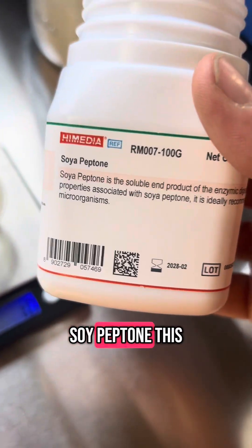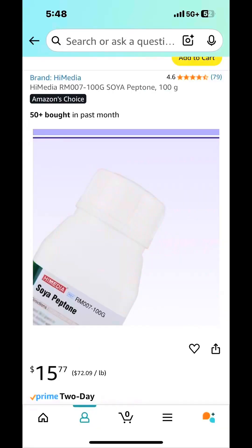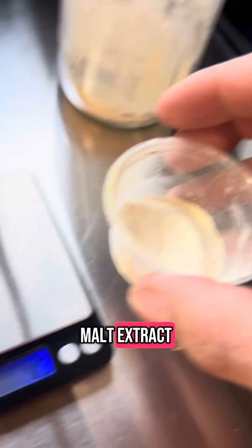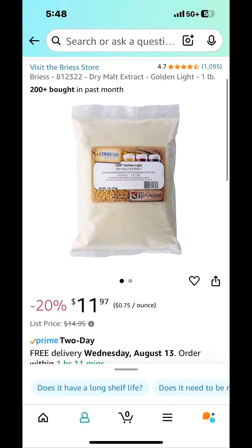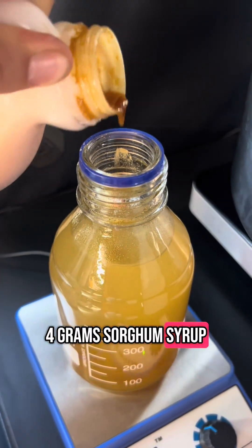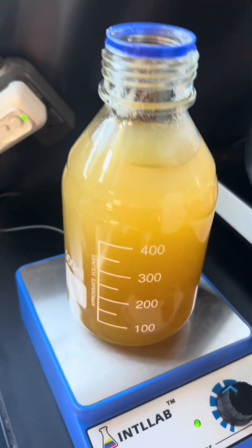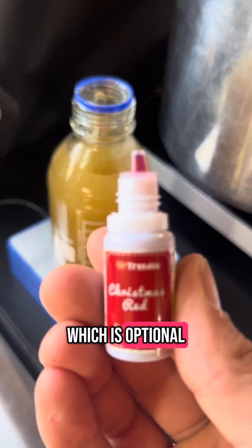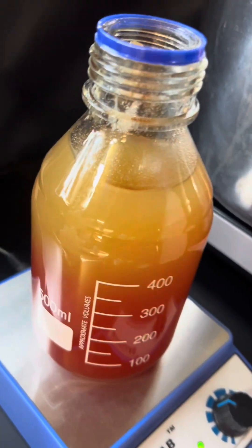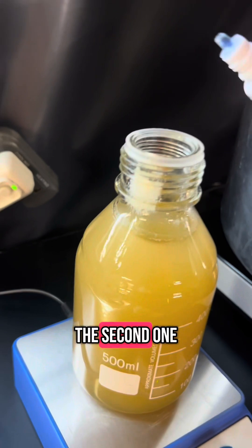One gram of soy peptone — this stuff smells really bad by the way. Four grams of light malt extract. And then about four grams of sorghum syrup, just a little bit. And food coloring, which is optional — we're going with a Christmas red for the first one and a sky blue for the second one.